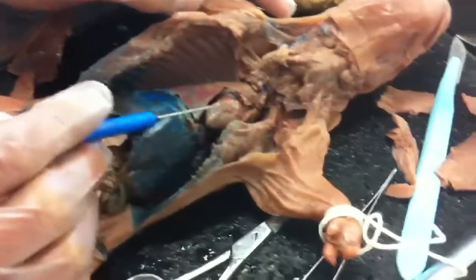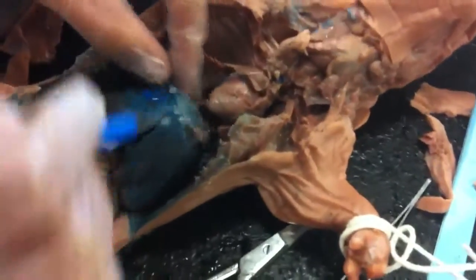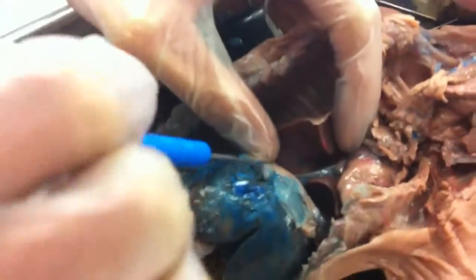The heart is right here. Diaphragm — that little piece of skin, this thing, right here between the liver and the heart and lungs. Diaphragm, yeah.